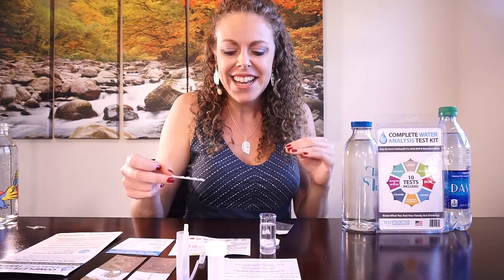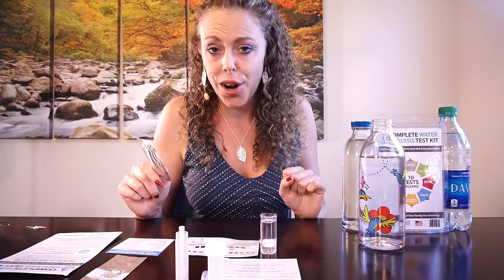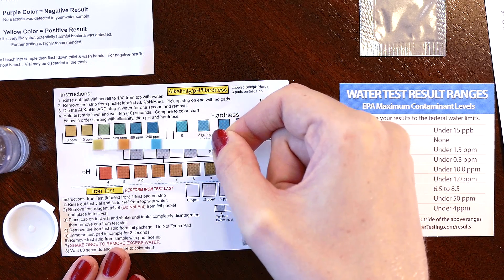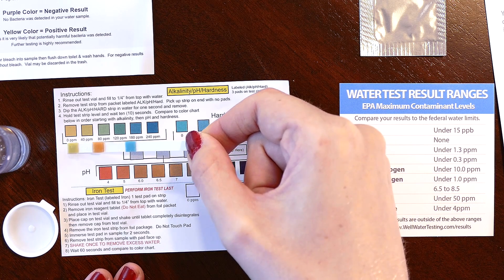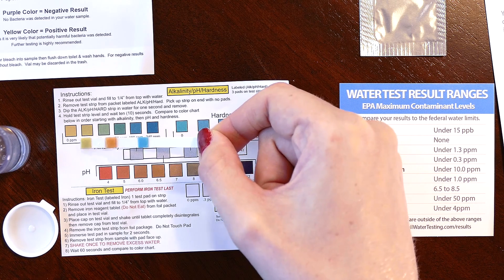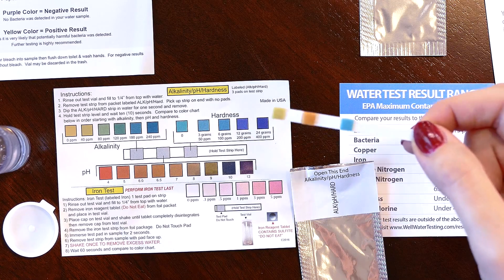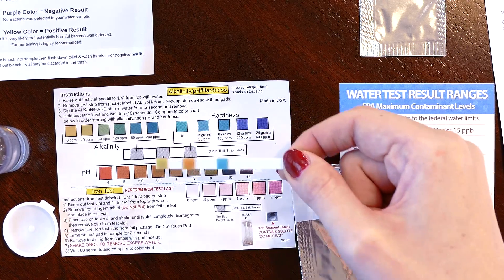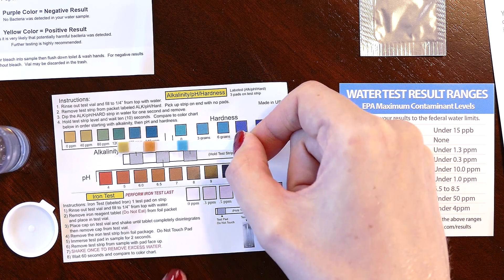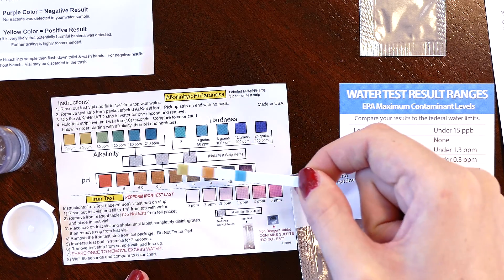Now moving on to the alkalinity, pH, and hardness test. On alkalinity, this looks like 40 ppm — slightly on the green side, falling somewhere between zero and 40 parts per million. On hardness, the far strip on the side, I would say that looks like zero — those colors match exactly.